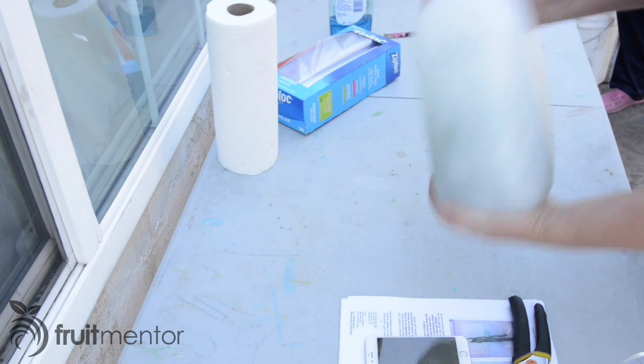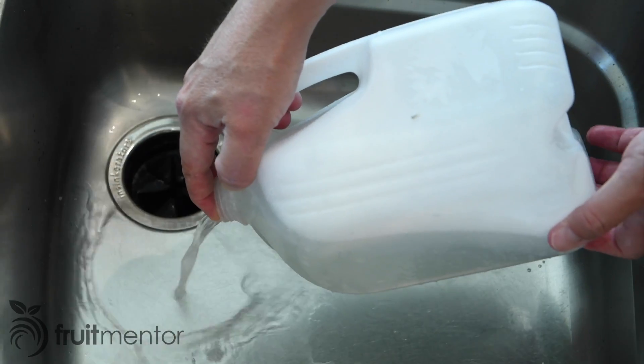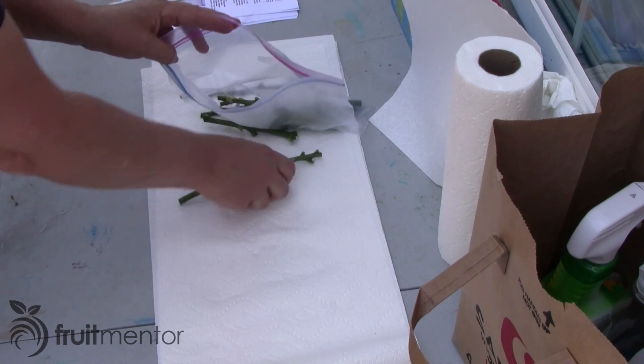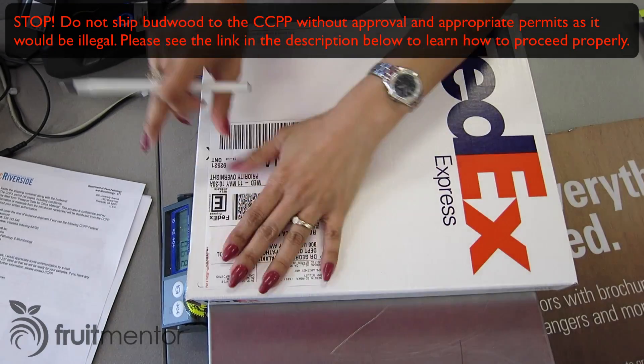If you submit a new variety to the CCPP, the cuttings must be washed in soapy water after removing the leaves. This is an important step to remove insects that could be on the cuttings. After rinsing and air drying, the cuttings are sealed inside of a plastic bag and shipped using an express courier service.